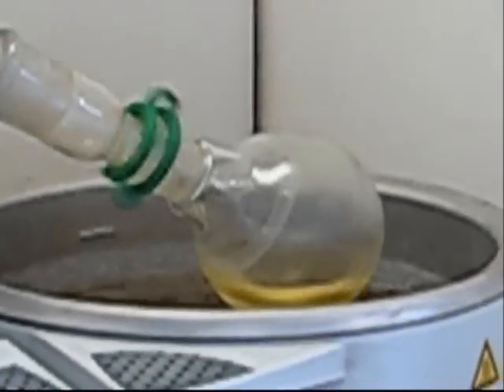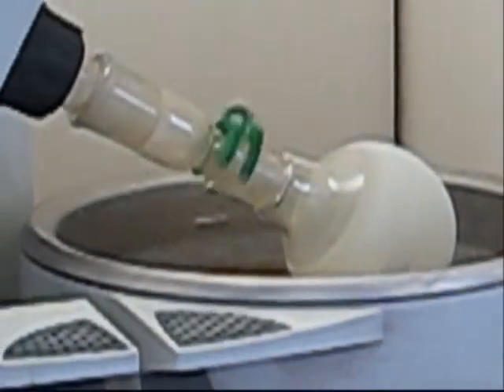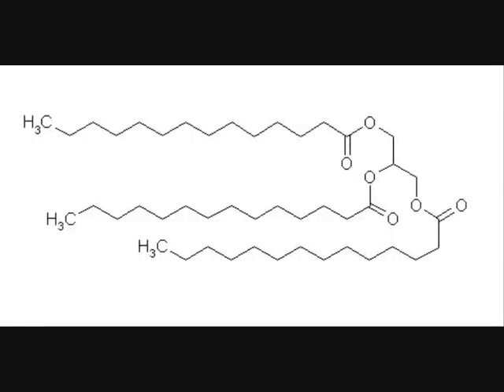The round bottom flask is rotary evaporated and the crude solid produced is recrystallized with acetone. This produces the natural product of nutmeg which is trimyristin.